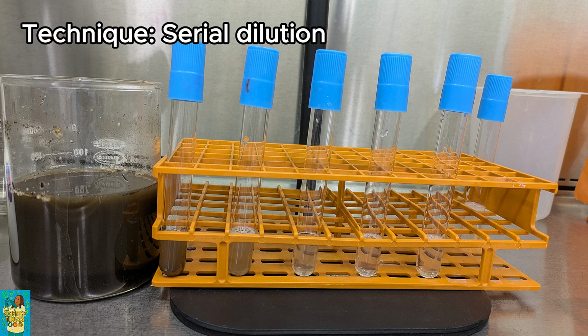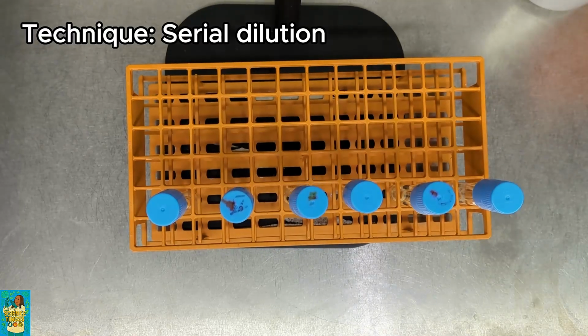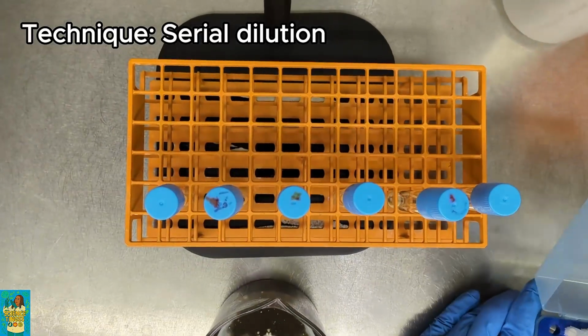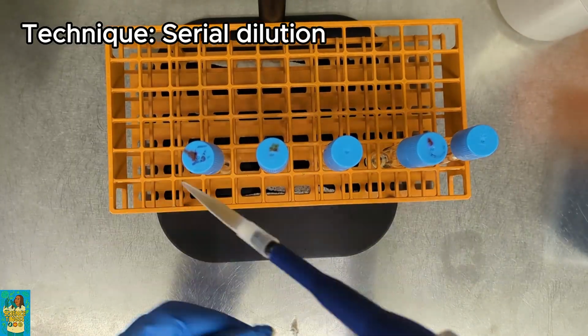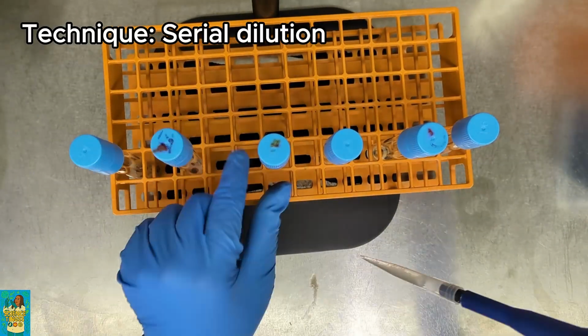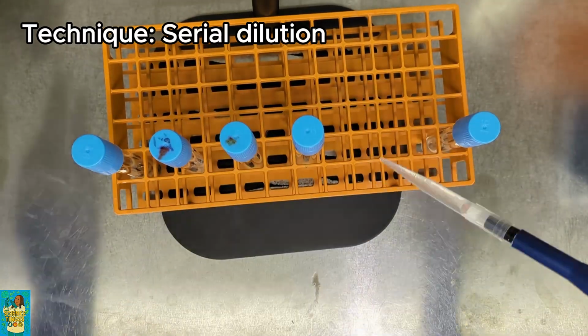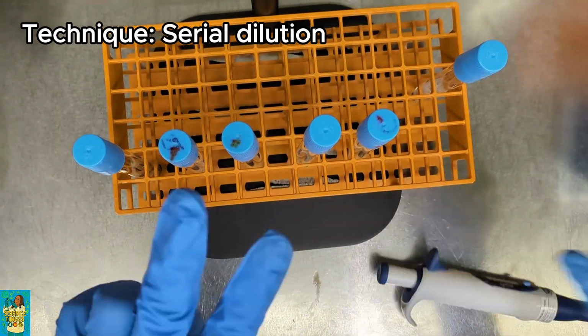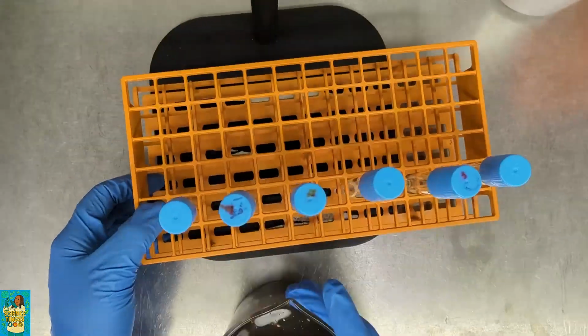serial dilution portion, where I have my original sample and I'll take 1 ml, so 1 milliliter from the original sample, put it in the first tube that contains water or salt and peptone, shake it up, take 1 ml from the first into the second, then from the second to the third, fourth, fifth, until I get to the sixth. So that's the process of serial dilution.